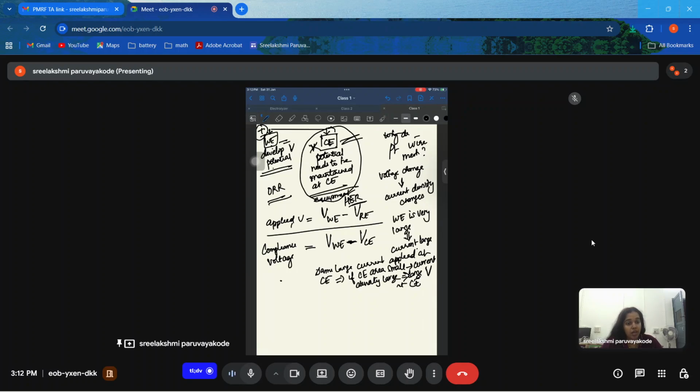Sometimes that becomes much higher than the limit to which the potentiostat can supply current. If we go to such a harsh current, we are abusing the equipment. So to minimize the current density at the counter electrode, we can go for a mesh-like system where the area increases and thereby the current per unit area reduces, and we are operating well below the compliance, the current limit.